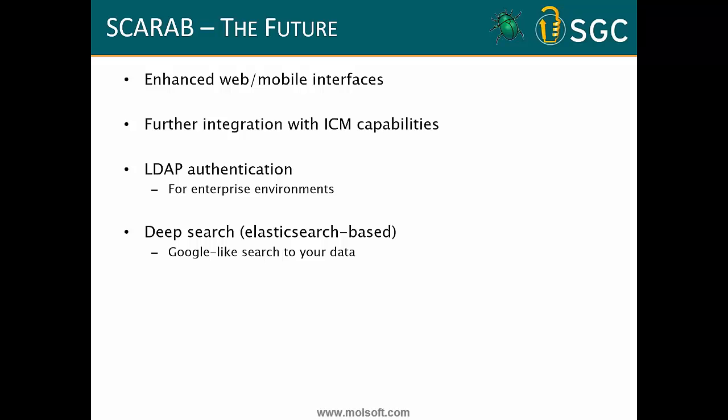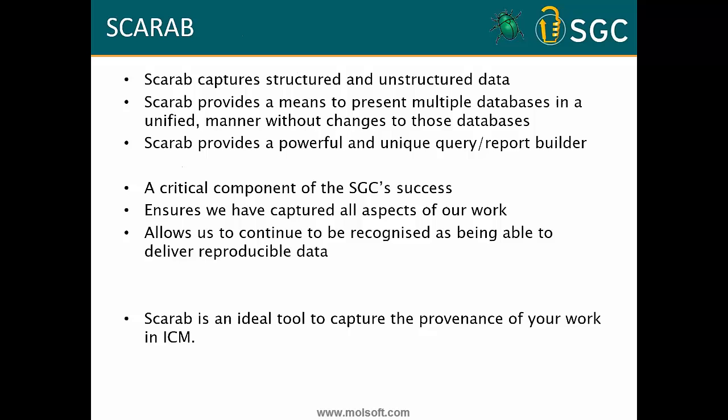And this is the final slide, just saying some of the things I've already said. Although Scarab has been written with SGC in mind, we've tried really hard to not make it SGC specific, in the sense that it should be possible to integrate it with any existing database, or if you want to build a database from scratch to capture your particular workflow, then Scarab is quite useful for that sort of thing.